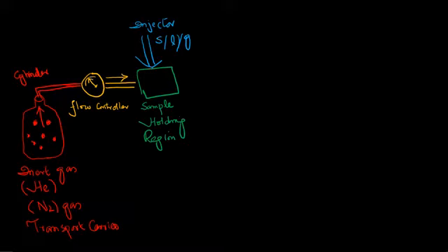Now, students, keep in mind that gas chromatography uses gas as a sample for analysis. In order to convert a sample we want to analyze into a gaseous form, a heating setup is usually used in case we are using a solid or liquid sample. Before injecting into the sample holding region, the solid or liquid sample is converted into a gas and then transported inside the sample holding region.